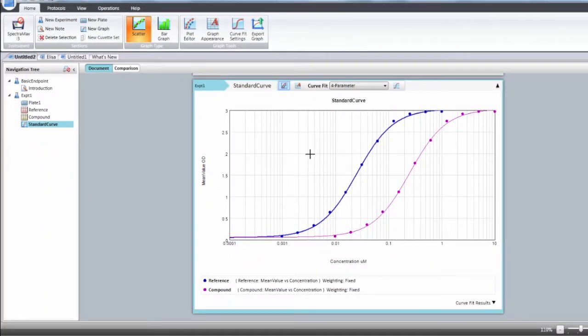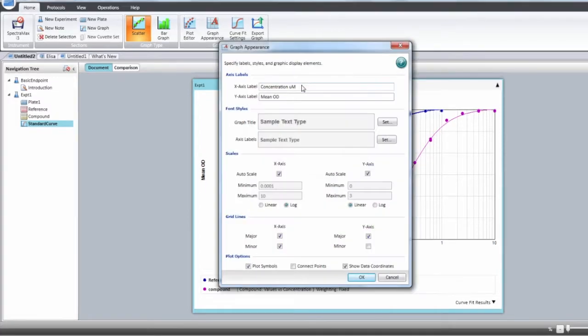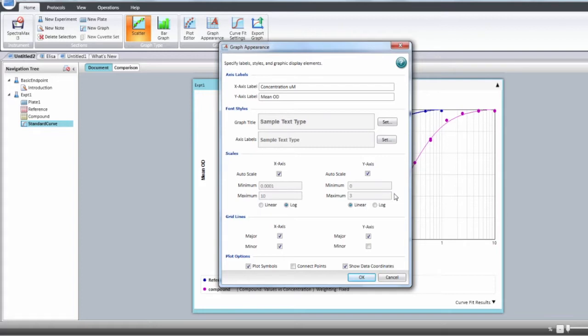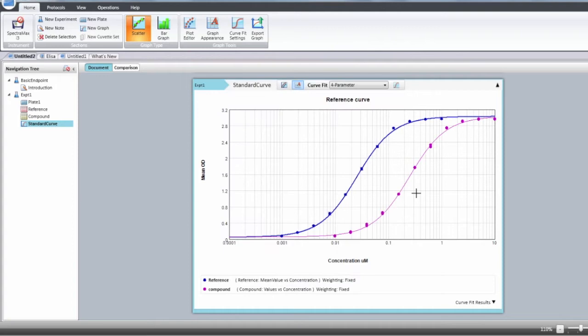We can then change the graph appearance and here we're going to change the scale in order to be able to visualize the top of the curve. So here unselect y-axis, change the maximum to the value you want, click OK and you can see that now we can really see the high asymptote of that plot.